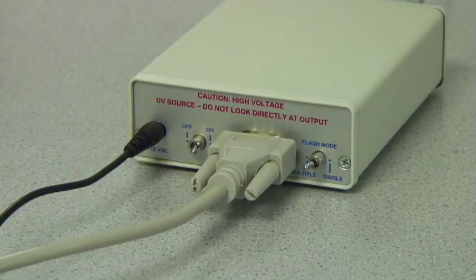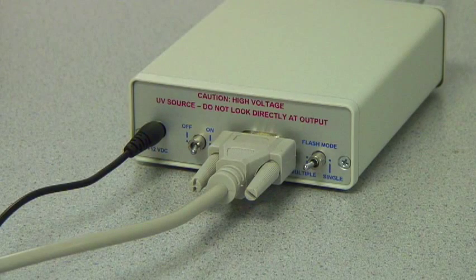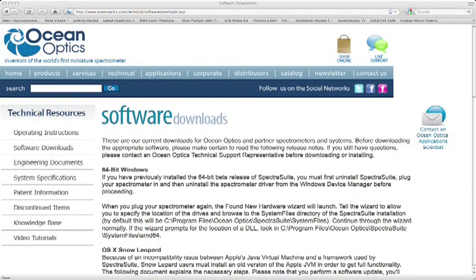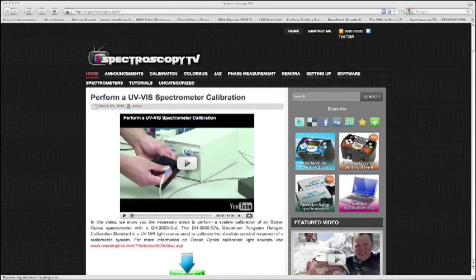In order to use your light source with your spectrometer, you'll need to configure the operating software. Before you go any further, be sure you have the latest version of SpectraSuite software. To verify the update, visit OceanOptics.com, click Technical, and then click Software Downloads. You can view our Getting Started with SpectraSuite videos all available on Spectroscopy TV.